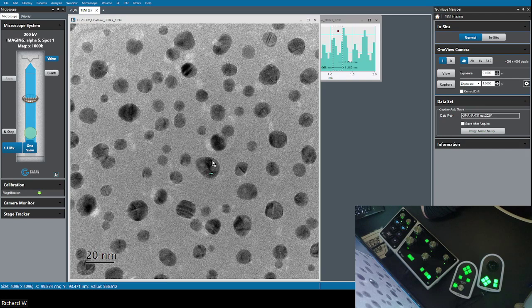So you might notice in your high resolution images that occurs. In this image it's particularly bad, and that's because I hadn't actually focused the image that well. So changing the focus can help a bit. But yeah, that's the delocalization effect. Understood. Thank you.